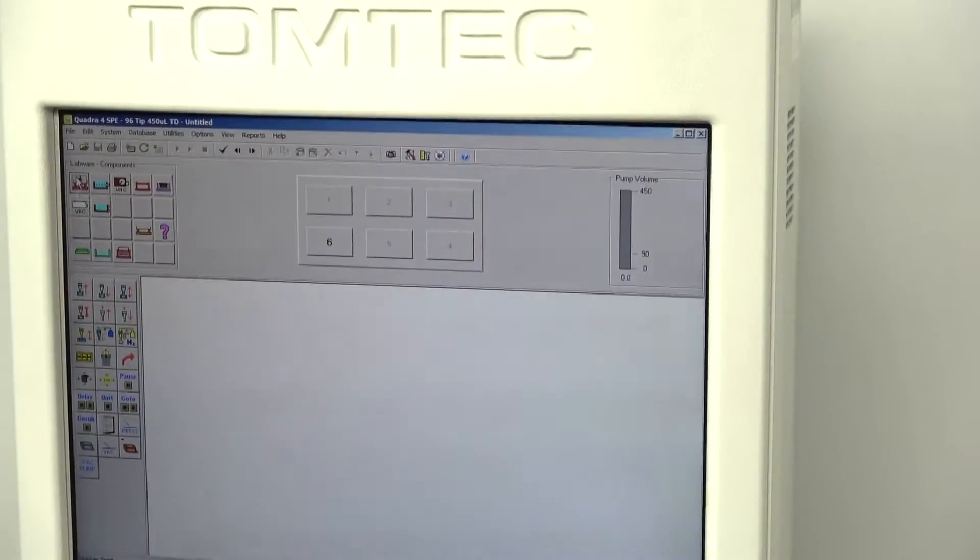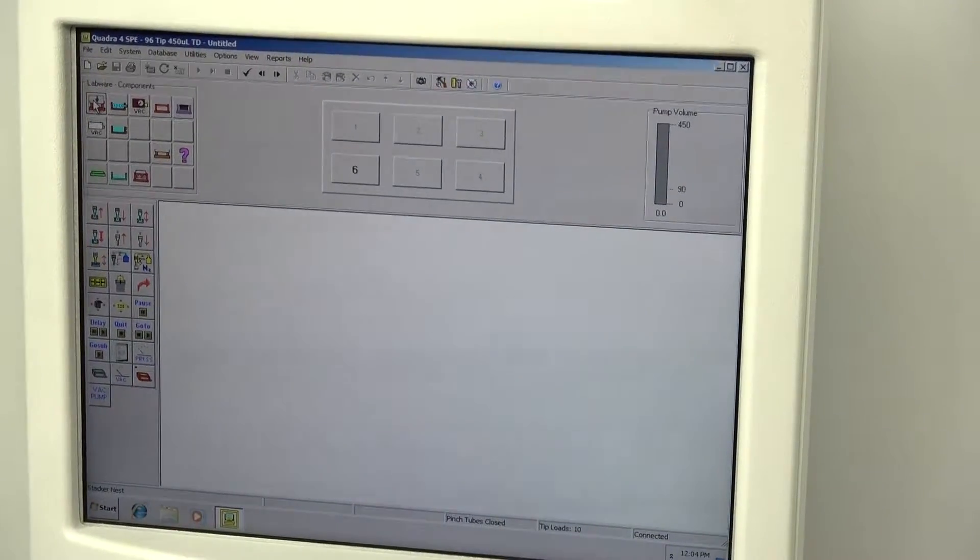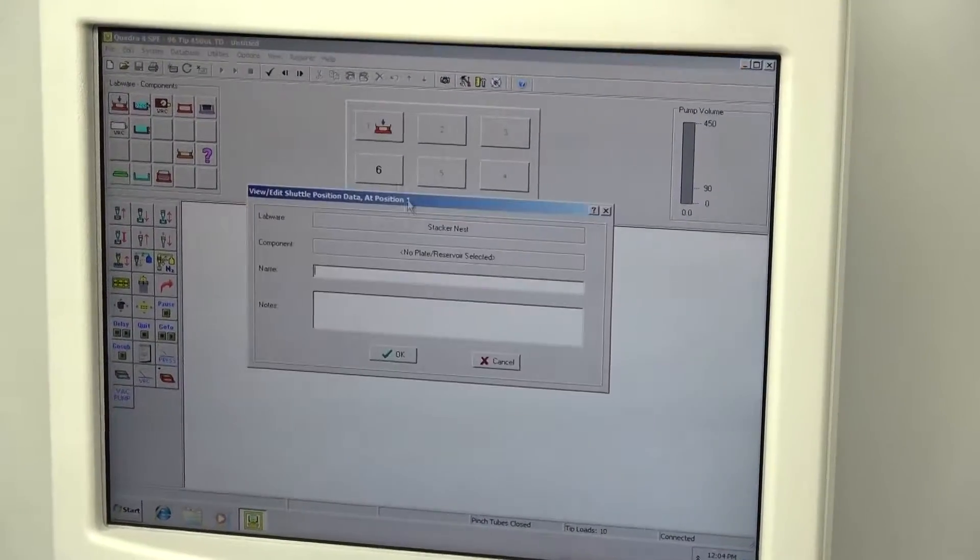If you can't remember what that icon stands for, you just hold your mouse here, it'll tell you what it stands for, and you drag it into the position.